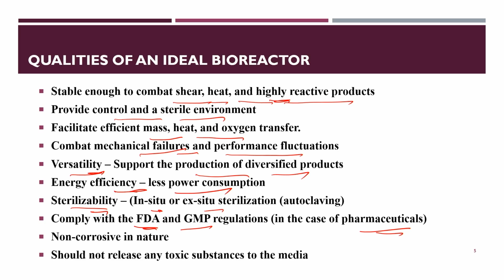These are very important for further utilization, and it should be non corrosive, and at the end it should not get degraded and release any toxic substance in the media.